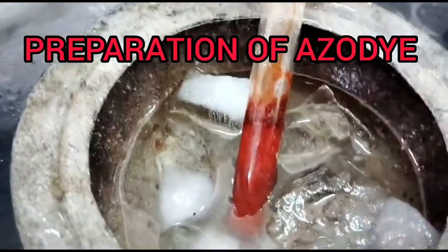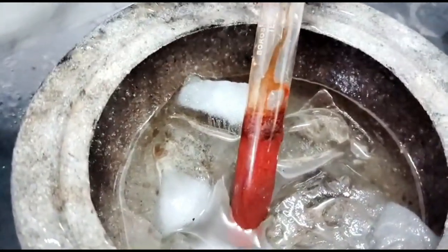Hello guys, today we will prepare azo dye from an organic compound containing nitrogen.